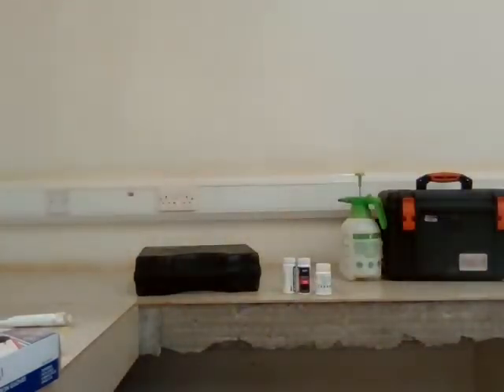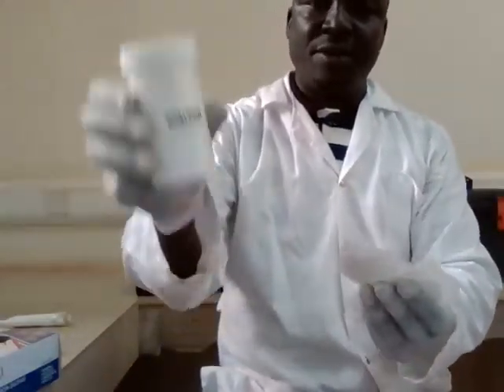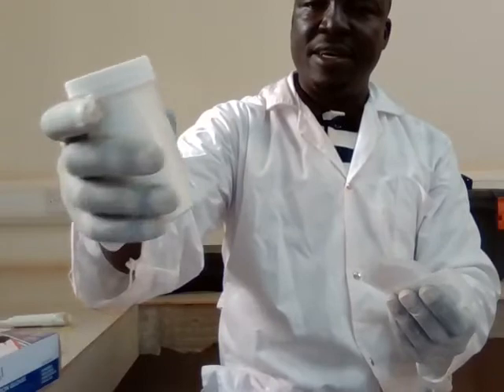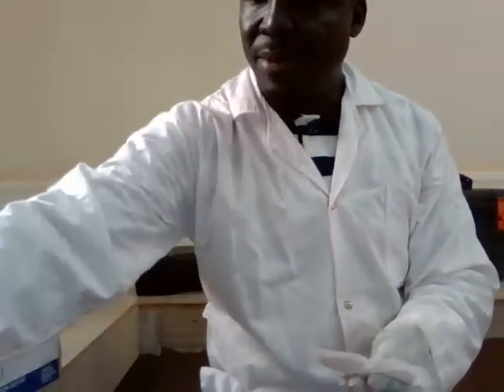We also have other consumables that are used, and these are sterile pads for absorbing the liquid medium after preparation.